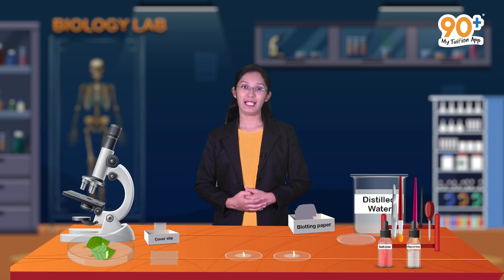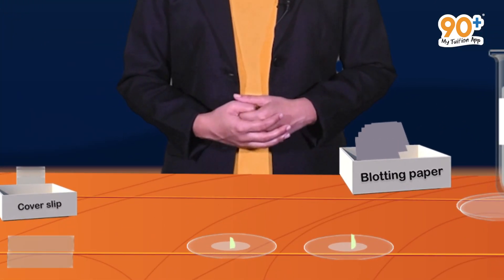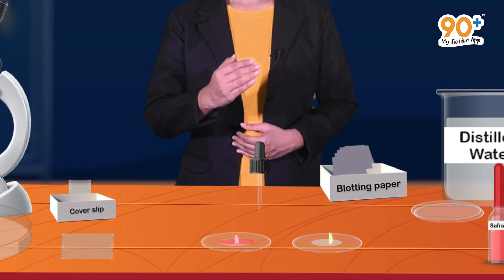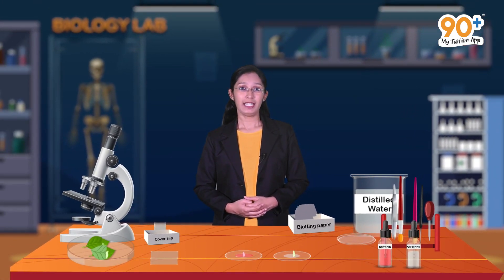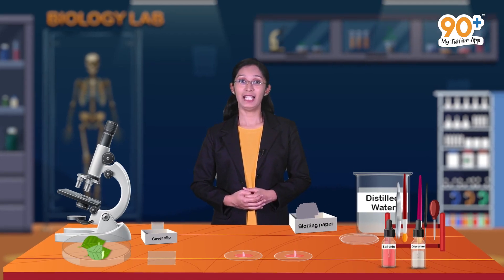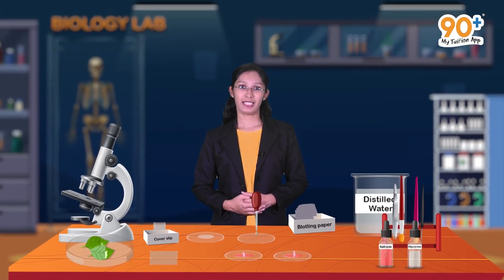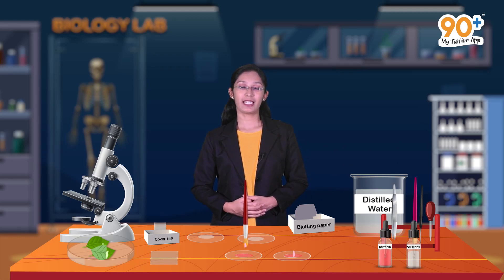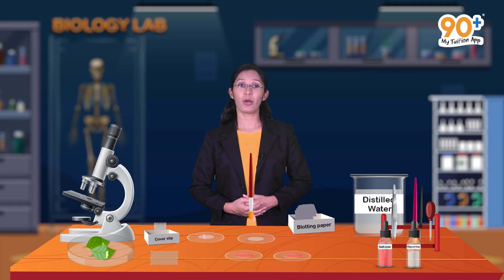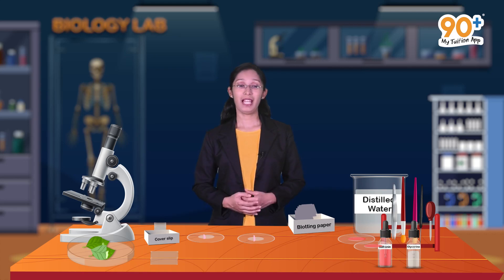Next we need to stain these peels. For this we make use of a stain called saffronin. A few drops of saffronin are added to the upper surface peel in the watch glass. Similarly, a few drops of saffronin are added to the lower surface peel too. Then in two separate watch glasses with distilled water, using a brush, transfer the upper surface peel to one watch glass and the lower surface peel to the next. This is done to remove the excess stain from the peels.